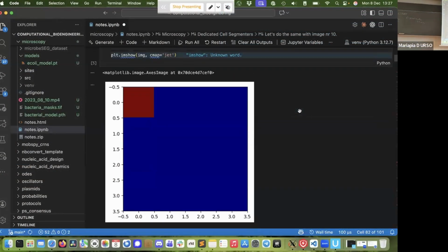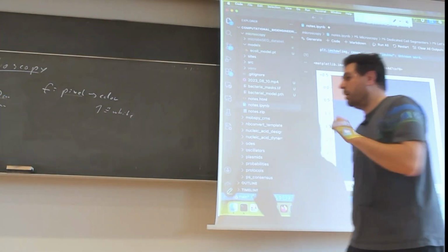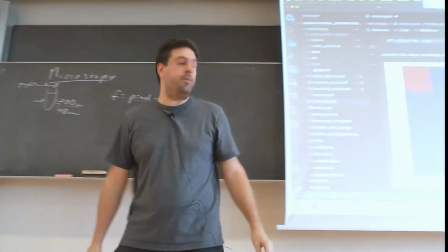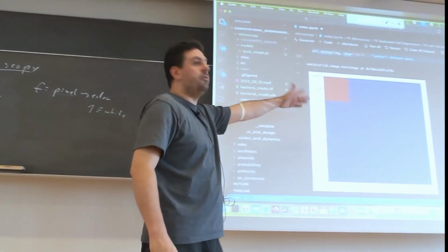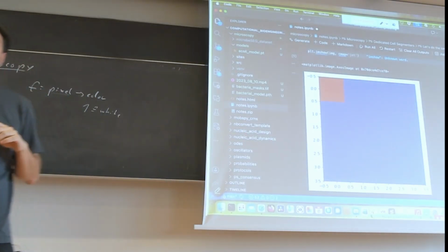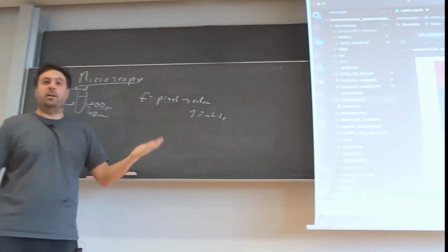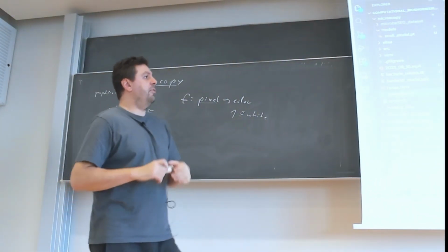And everything else would be a shade of gray. Just to show that I was not making things up: if you put in another color map, for example, one that is very commonly used and that we will be using also for labels, the image looks completely different, right? So this is underspecified. If you don't specify your color map, it's not clear how it will visually look. The array is the same, of course, but the visualization is different here.